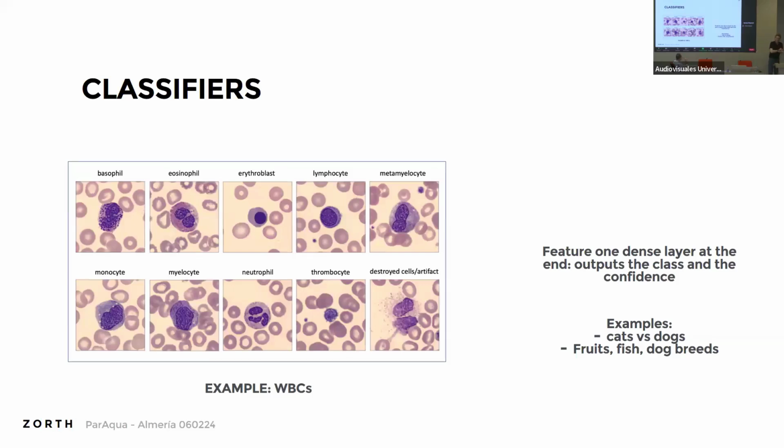Take a thin smear of blood. So basically, you make a blood slide and you stain it using Giemsa and water at the right pH, so that you get the right colors, and you will see your red blood cells. You will eventually see your platelets. So those are clumps of platelets. You will see your white blood cells, WBCs here. You've got various classes of white blood cells.